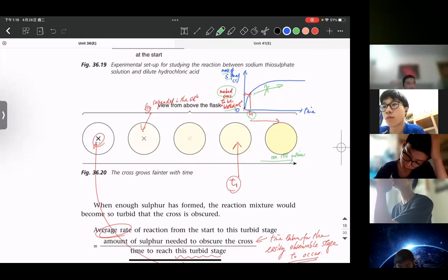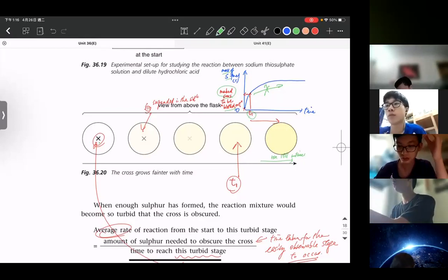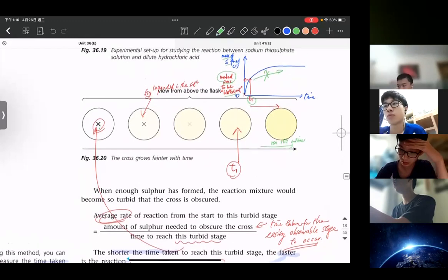So it is well justified, right? That's for the second set of experiment. It will take longer time, right? Why? I dilute what solution? As the solution is diluted, the particles inside decrease. Oh, so the particles inside decrease.